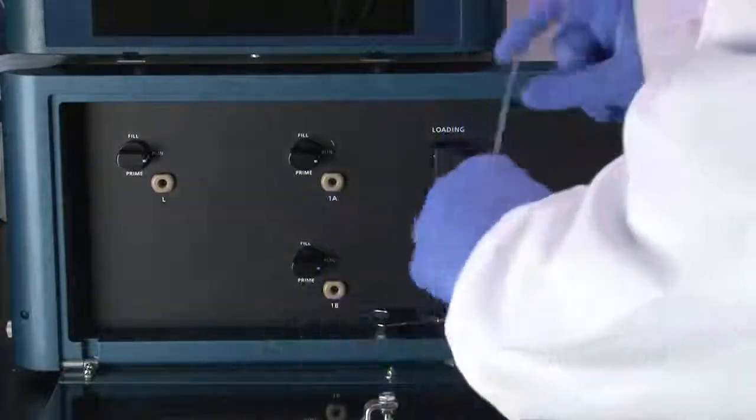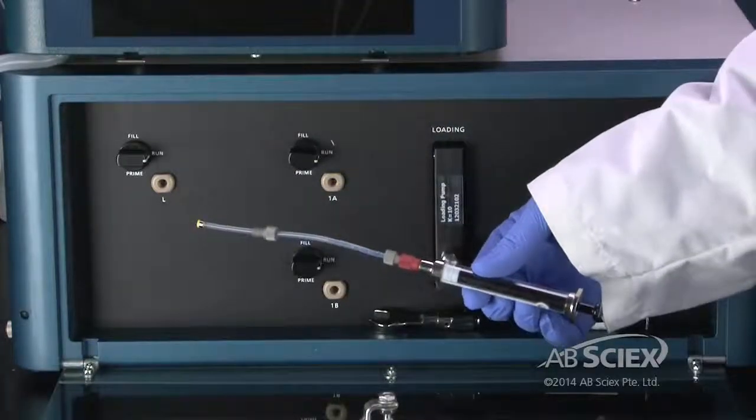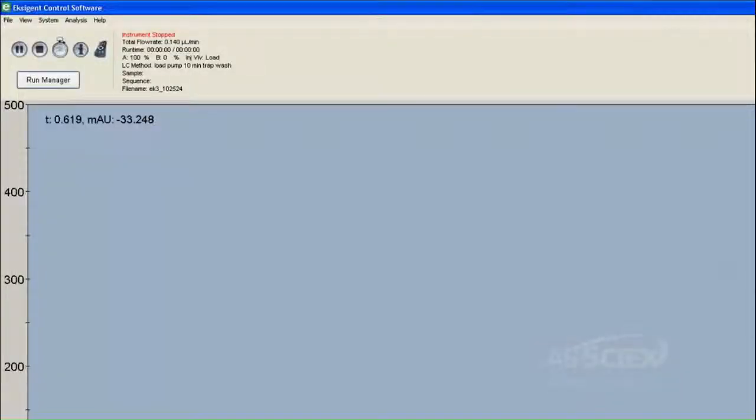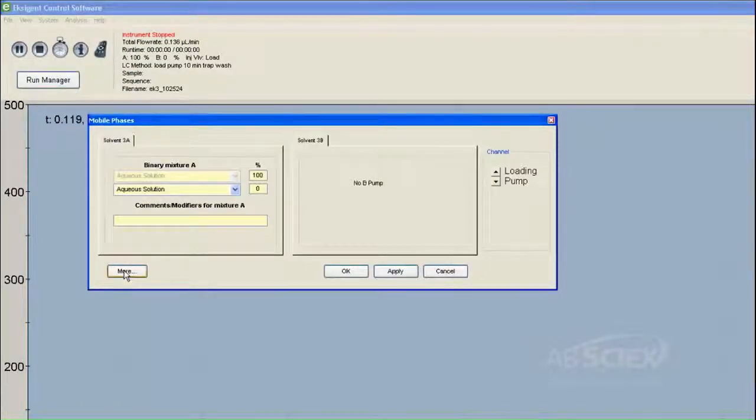Assemble the priming syringe. Empty the priming syringe. Open the Exigen software. Click System Mobile Phase window and select the appropriate channel. Click More.